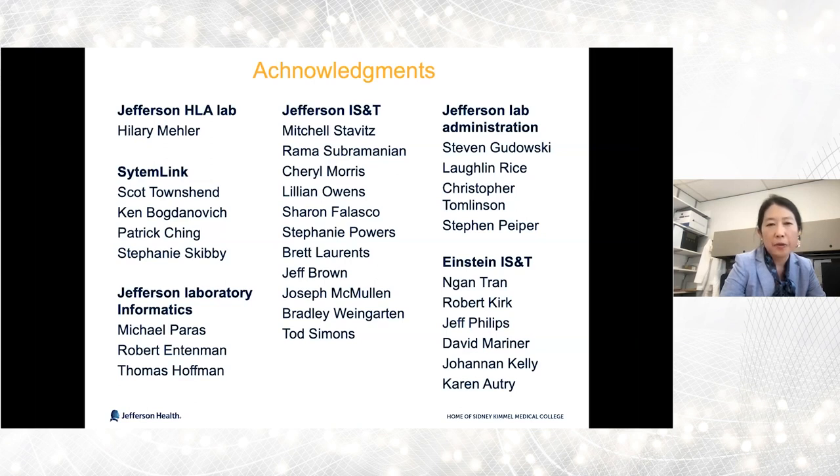He's really great. We are still making changes to our incoming order module. Since go live, we have made probably several changes, and Patrick always did a wonderful job getting results back to us. Stephanie helped me with the clinical report. I think my request was really challenging, but she was able to get it done. For the Jefferson part, Michael Paris is really the project keeper.